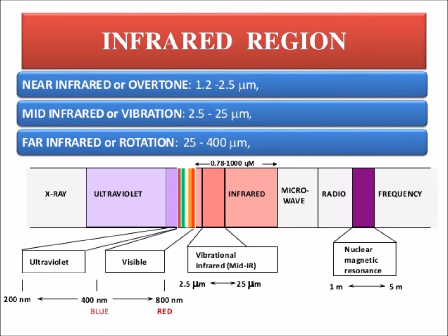Astronomers attempting to observe weak infrared signals from distant stars and planets in the far IR region of the spectrum, approximately 400 to 10 wave numbers, could not obtain clear or accurate spectra with the prism and grating spectrometers of the 1950s. This then spurred the development of analytical techniques with high degrees of resolution and accuracy, from which FTIR spectroscopy was realized. It was not until the late 1960s that FTIR spectroscopy was made practical for regular laboratory uses.